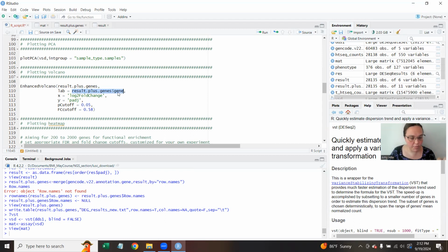And if you remember from the lecture, there are a lot of gene symbols in the volcano plot. Including this option, it's going to label as many dots from those significant quadrants as it can, the ones with the smallest adjusted p-value and largest fold change.